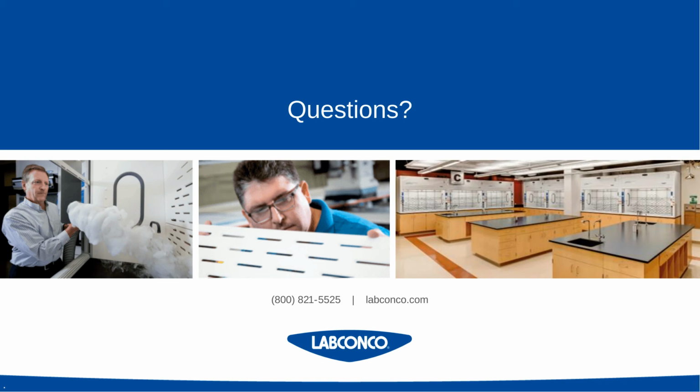Great, thank you, Kasey. Our next question, should high-performance hoods always be operated at 60 feet per minute face velocities?